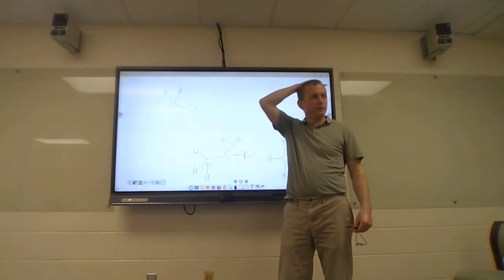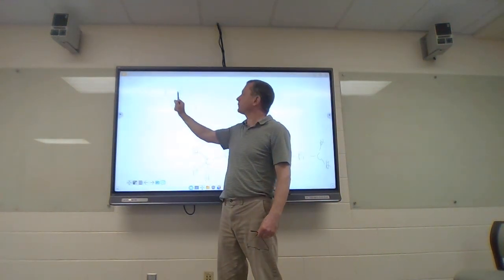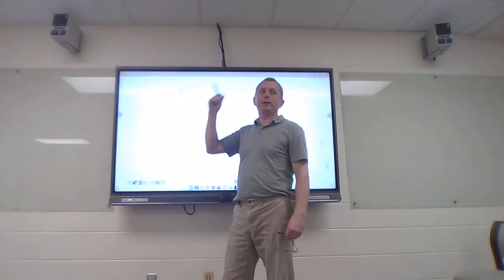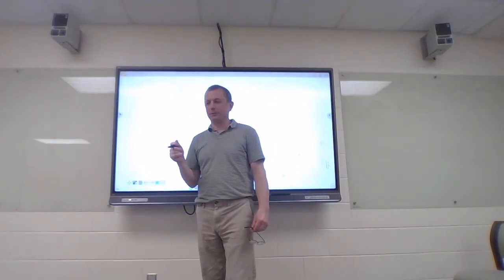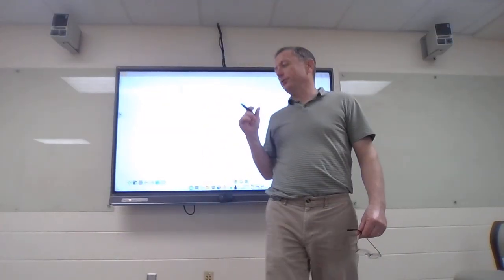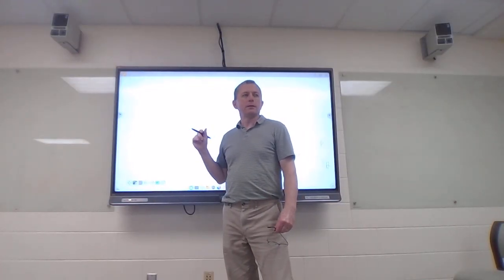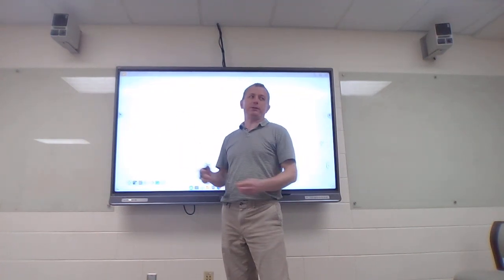Yes? How did you get to that point? I'm still lost. So you're looking at that chemical shift, and that chemical shift fits for hydrogens that are near an oxygen. But why didn't you connect the oxygen straight to it? Because that would have a different chemical shift. If you look at that chemical shift table, a hydrogen attached to an oxygen can land over a really broad range, if I remember right. Yeah, but how do you get the oxygen to land in the same range? It could, but it goes in a much broader range, right?